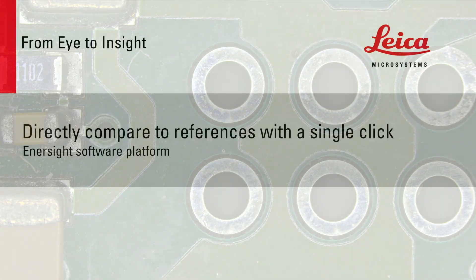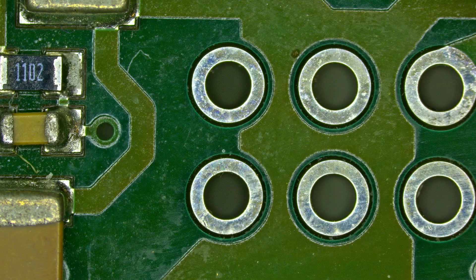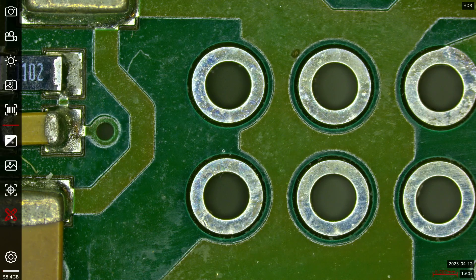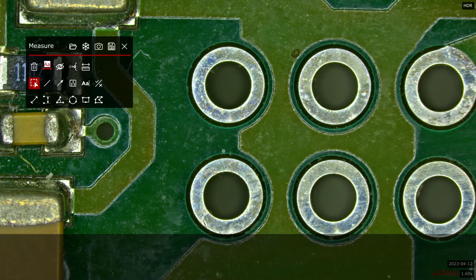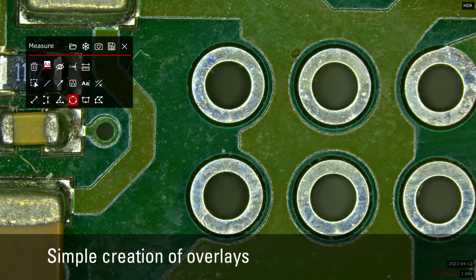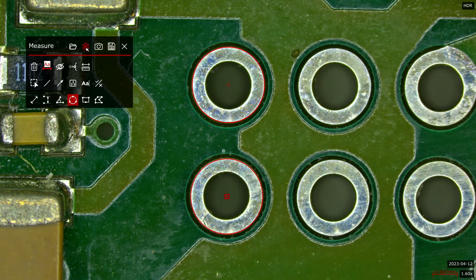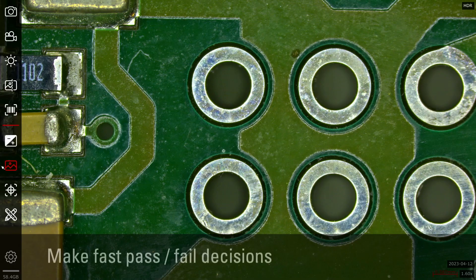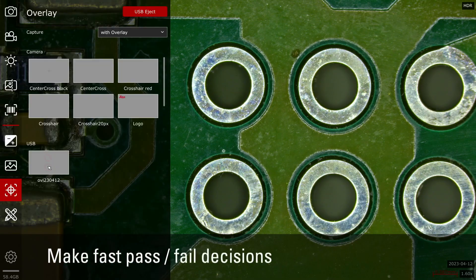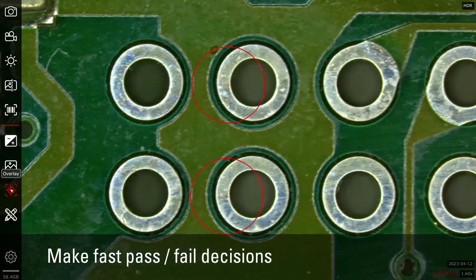With the Enersight software platform, directly compare to references with a single click. Create customized overlays directly within the Enersight software platform. During inspection, you can compare your live image directly to facilitate pass-fail decisions.